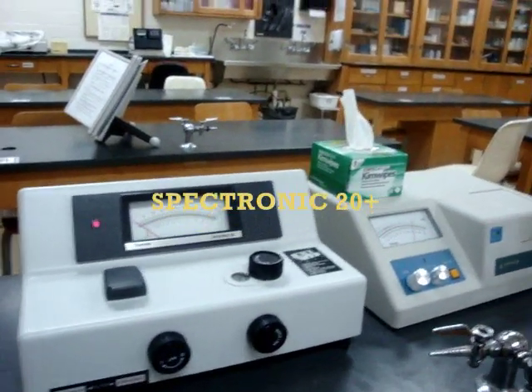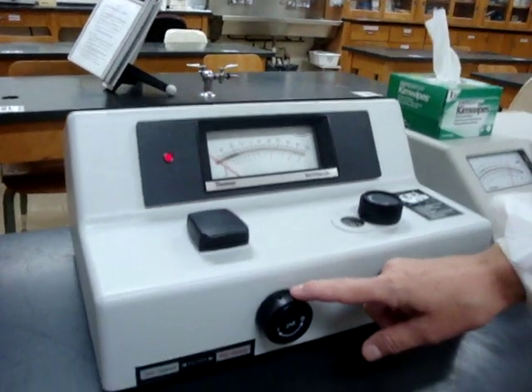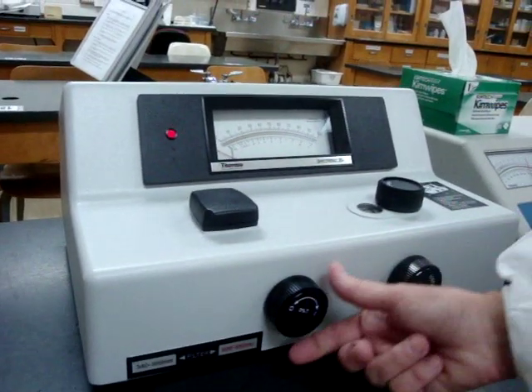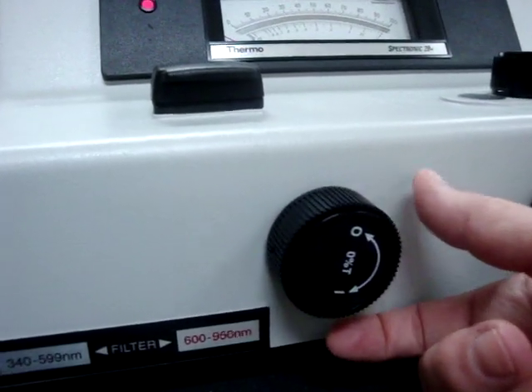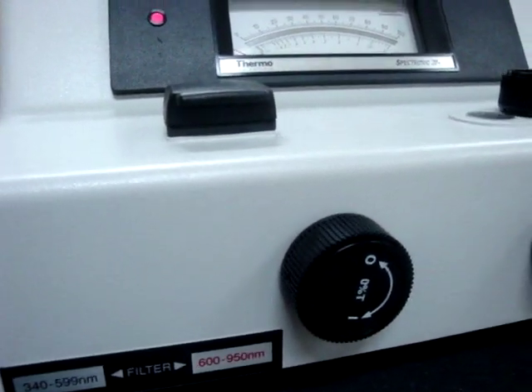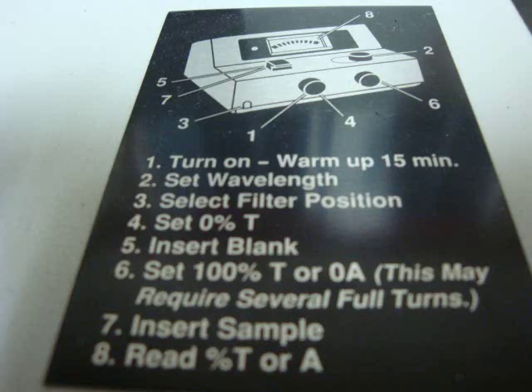For the Spectronic 20 Plus, you turn it on by turning the zero percent knob to the right. This machine is set up a little differently from the Spectromaster — the instructions are right on the machine itself. We will place the blank in at a different time frame than we did with the Spectromaster.